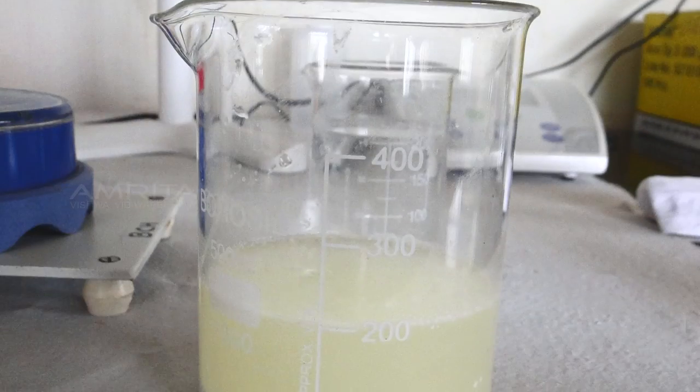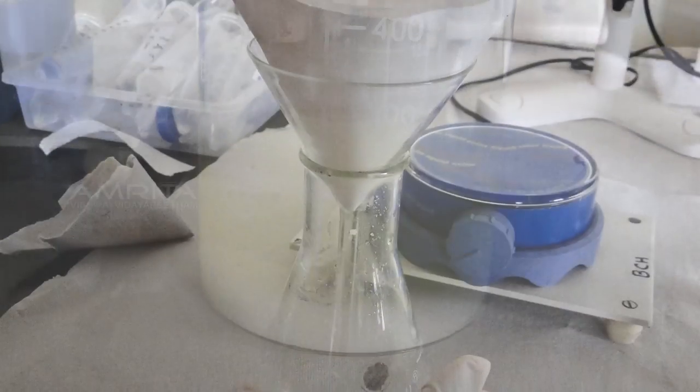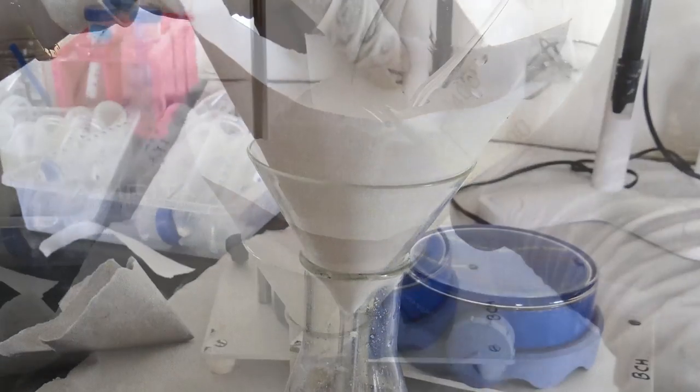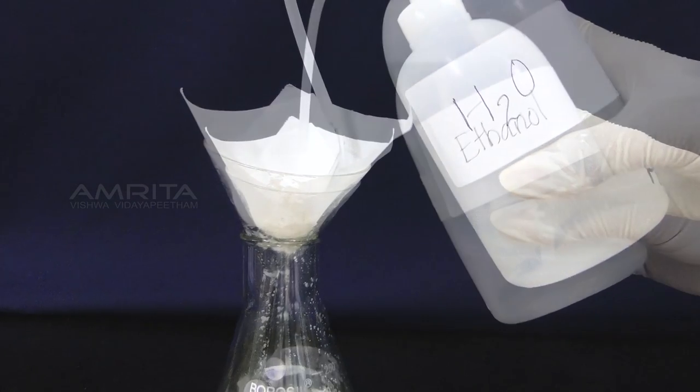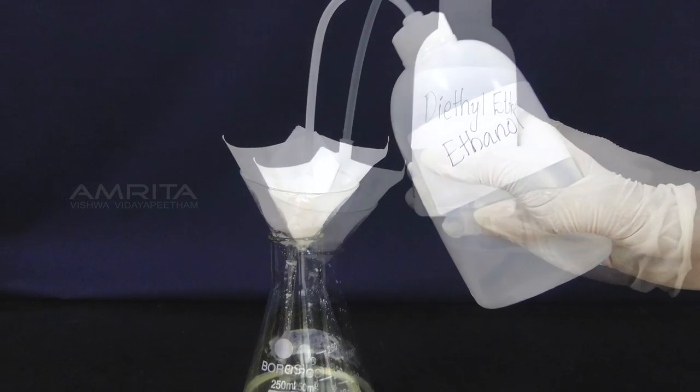Wait till the precipitated casein settles down. Filter out the casein by pouring it through a funnel and a filter paper. Wash the precipitated casein first with distilled water and then with ethanol and lastly with diethyl ether.